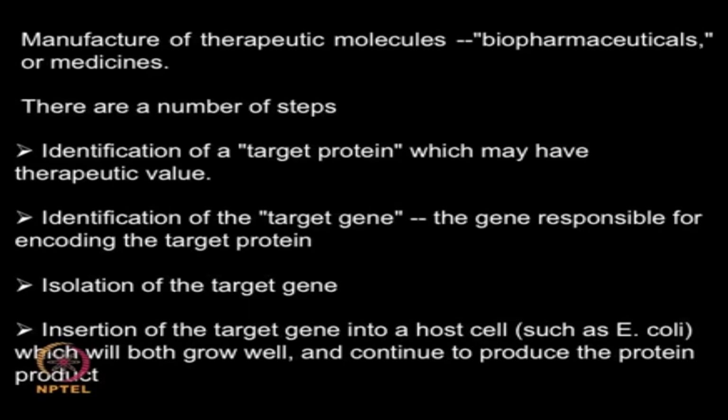Now let us look at a therapeutic molecule, for example, a biopharmaceutical or a medicine. How do we go about deciding on a chromatography based separation?